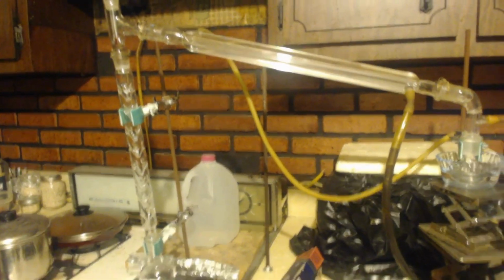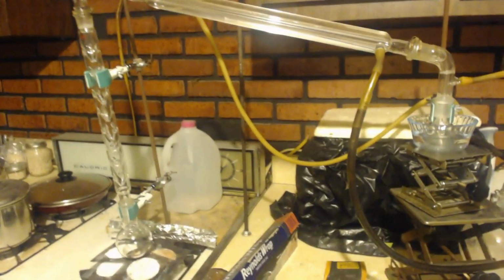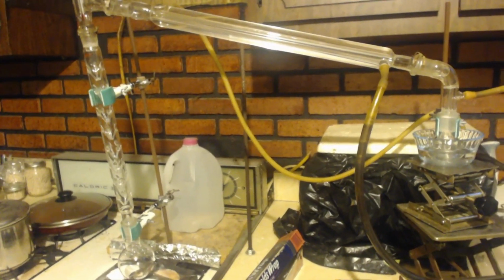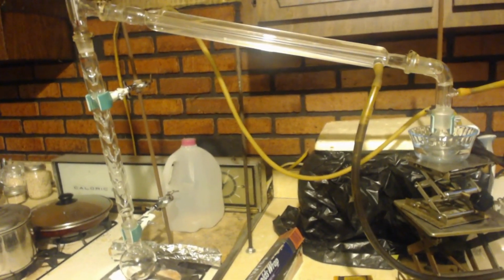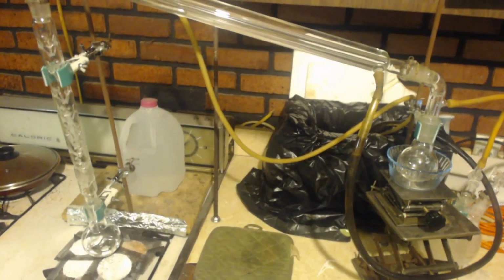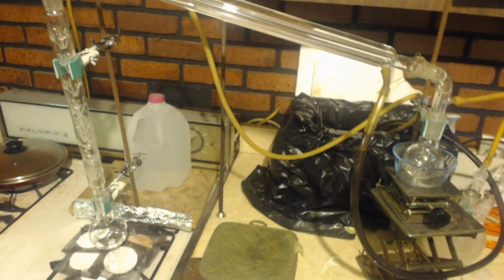But I took my product out, and this is the apparatus. I'm going to distill it to see exactly what I have in there. How much DCM, how much trichloromethane, how much tetrachloromethane. There's my apparatus. I got the pot here. I'm going to distill it.